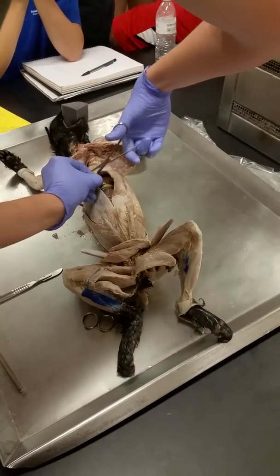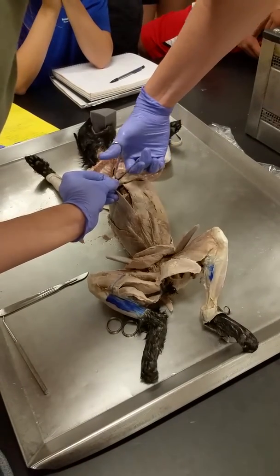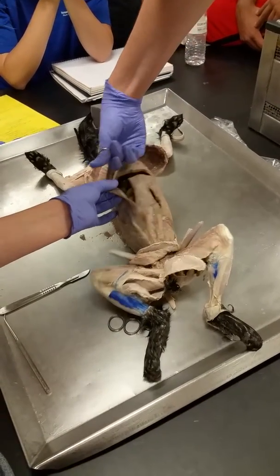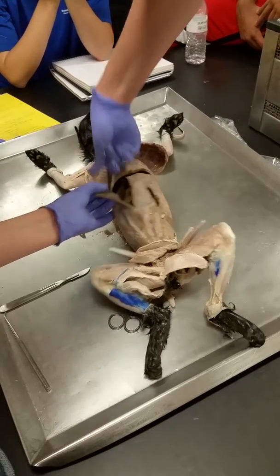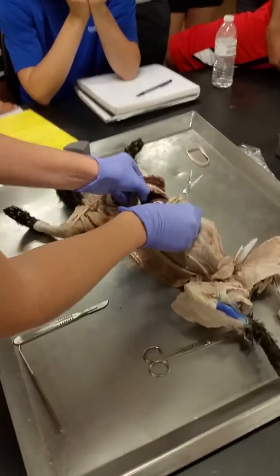Oh, fatty. There. So here's my diaphragm.